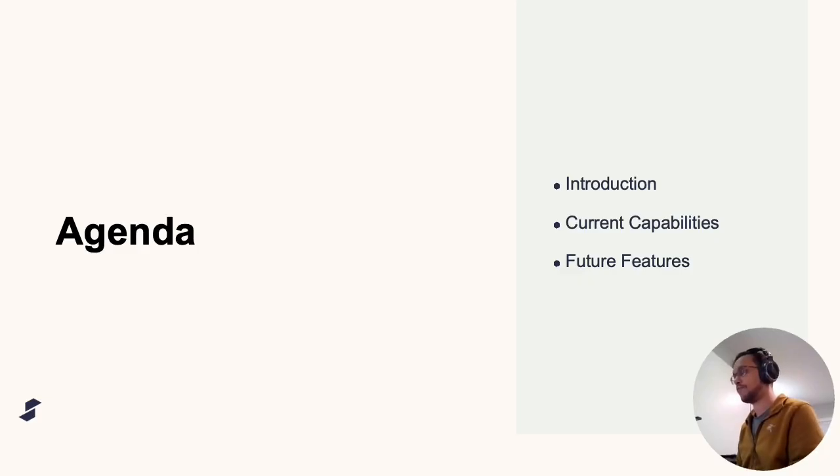Today's agenda is as follows. We'll begin with a brief introduction on what molecular biology is. After that, we'll dive right into Molbio, looking at some of the current capabilities that the software contains right now. And then we'll end with a short slide on what we hope to implement in the software going forward.